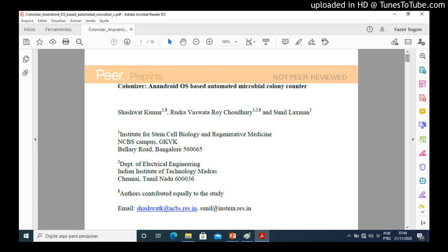They use a circular dark field illuminator with a UEye 1640C camera for imaging and a PC for adaptive thresholding and segmenting colonies. These setups require additional hardware components, some training or learning, and technical expertise for the design of the system.